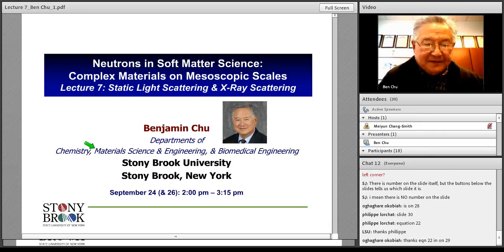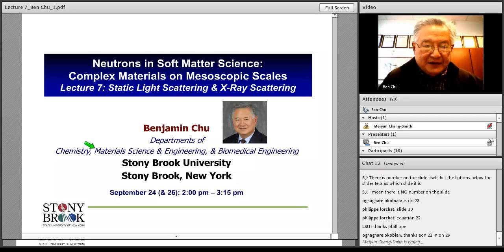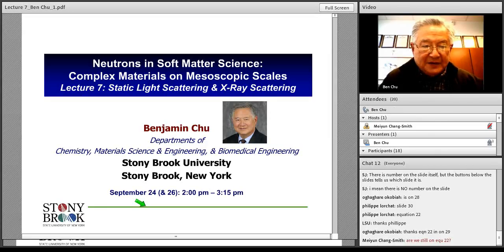So in the Rayleigh ratio for the excess scattered intensity, if we want to take into account P of Q, the particle scattering function, then before we had only HCM, as we have done before. Now we have added an interference effect, and that interference effect is coming from interference of the size of the particles and so forth. We want to take that into account.